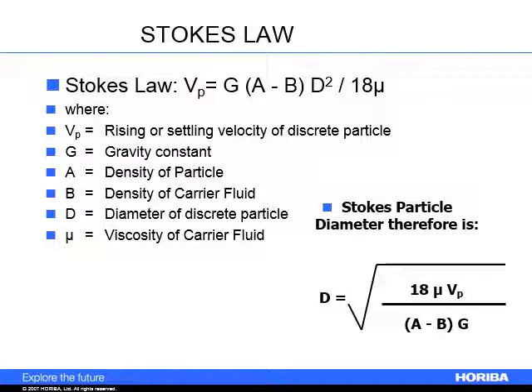This is what you would use when you want to have something like a centrifuge and want to know what percentage of big particles I get out by centrifugation versus what's left in the finer part of the liquid. You can use Stokes' law to help you determine that.